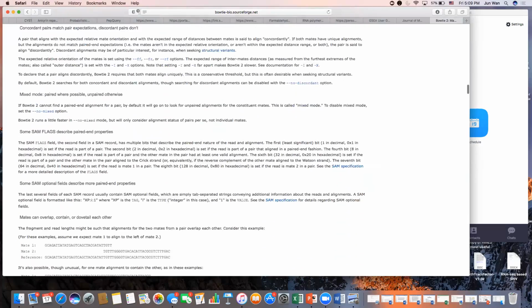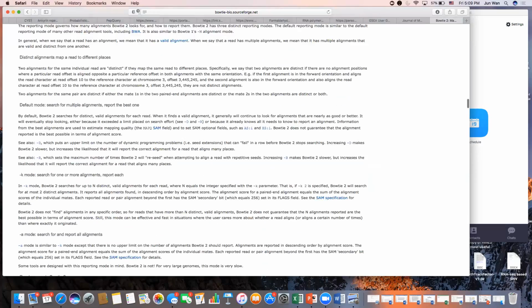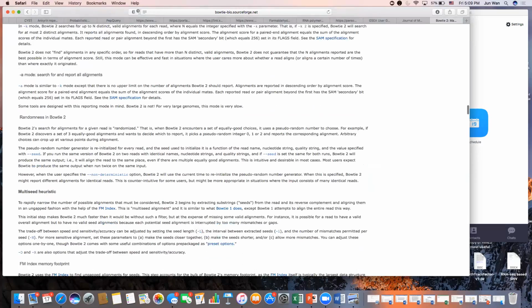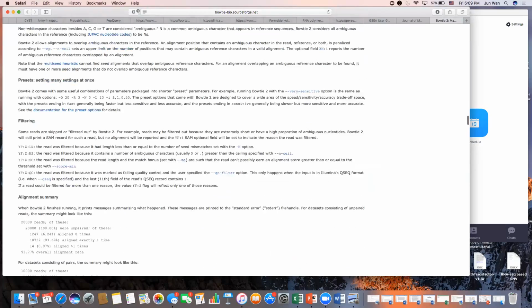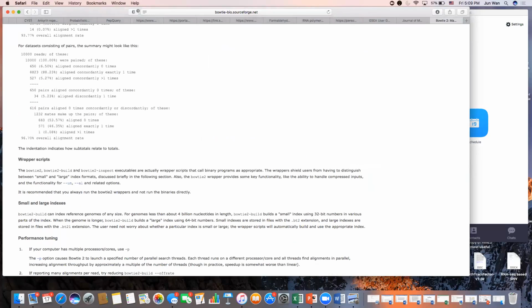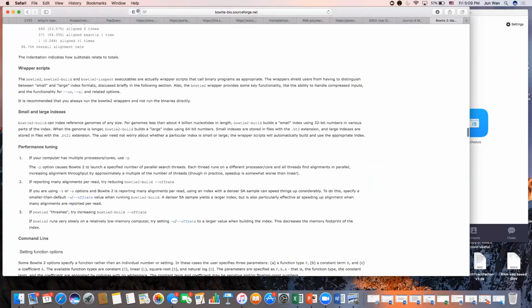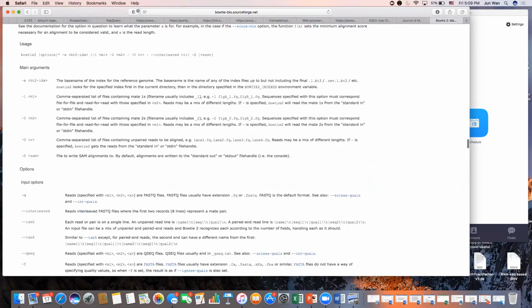Well, this is going to have an index file, but it's going to be a set of 6 files. And the reason for that is it breaks the genome up into smaller pieces, and then it actually compresses them and improves the speed for alignment. Where it went nucleotide by nucleotide for BWA, it was long and it churned. I think you're going to see this is much different. Let's get down to the usage. Here's our command.